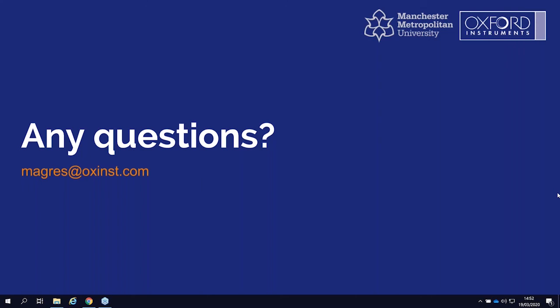Thank you very much. Again, lots of questions on the technicalities there. So following on from that, we've had a question from Daniel Taylor, who asked how fast you really can flow the reaction through the machine. Clearly you showed that as you increase the flow rate, you do lose some acuity in your results. But what do you think the limits really are, and still getting usable numbers?